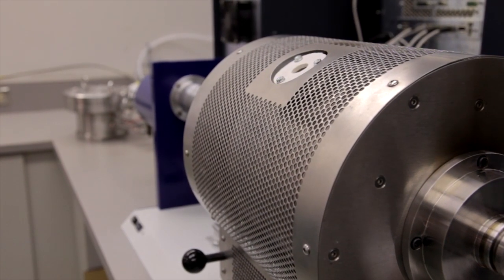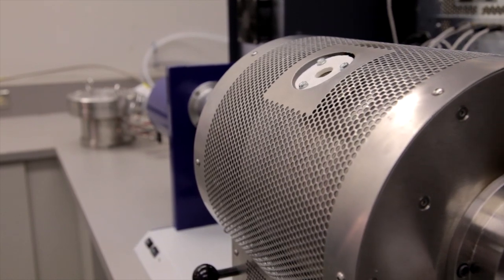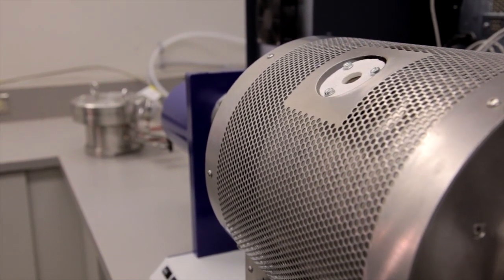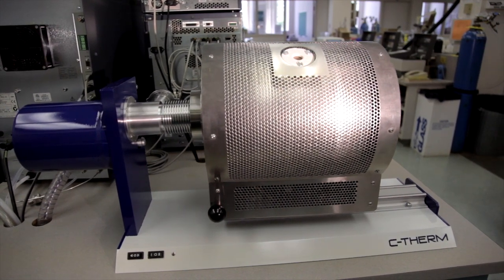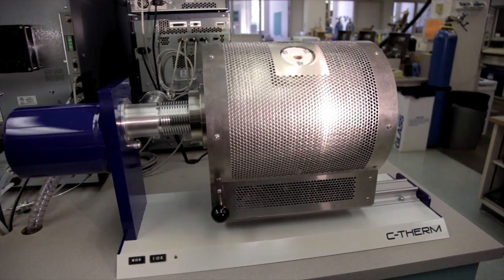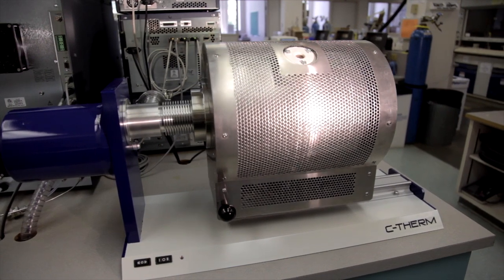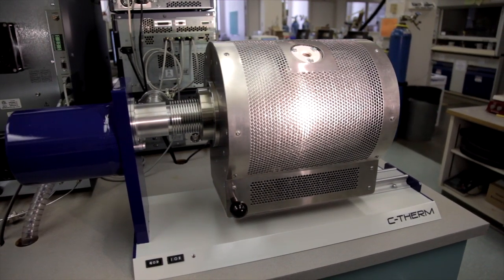C-Therm's most recent innovation is the option to pair the TCI with the new vacuum-tight horizontal pushrod dilettometer series. C-Therm dilettometers offer the highest sensitivity in determining dimensional changes of a sample as a function of temperature.